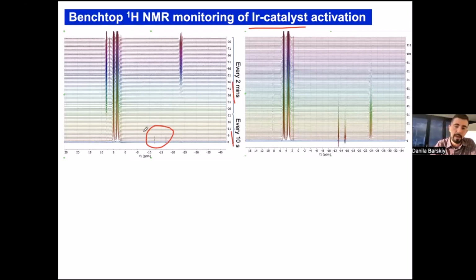And you can see that some chemicals go. So we understand partially in some situations what's going on. In some situations, I tell you honestly, we still don't understand. We see that, for example, even here, some intermediate disappeared, then you had nothing in the proton NMR spectrum for some time, and then another intermediate and catalyst complex starts showing up.